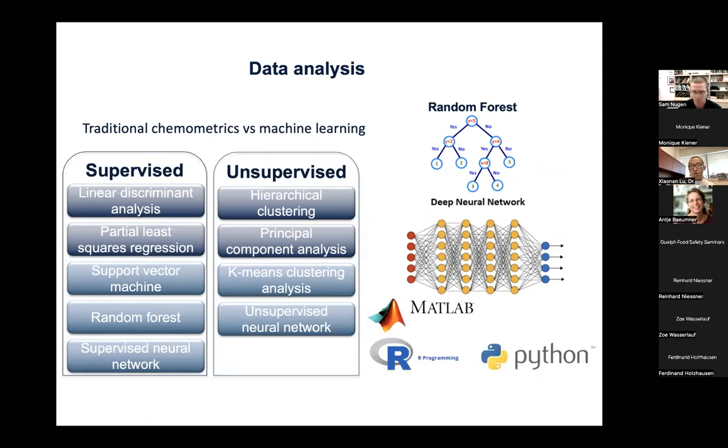So in the lab, we use MATLAB, R, and also Python to write the coding and programming. And on the basis of those chemometric models, along with the machine learning models, we can get a better understanding about the Raman spectra that we received.